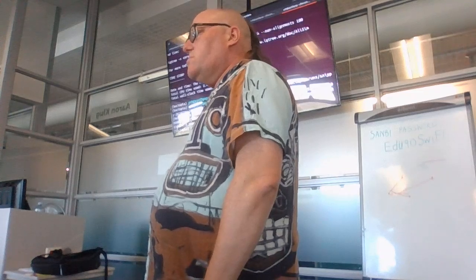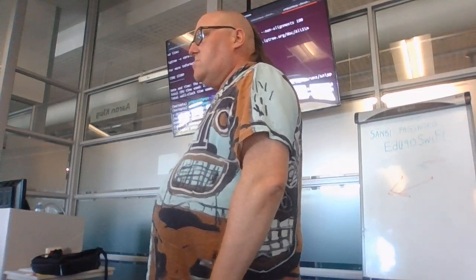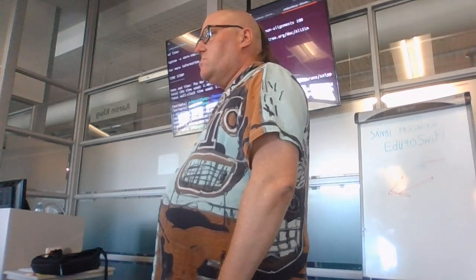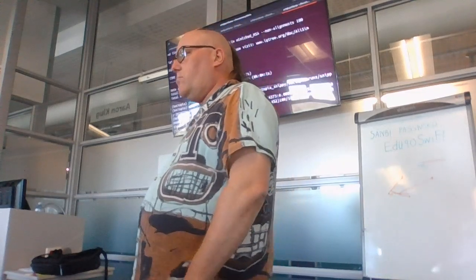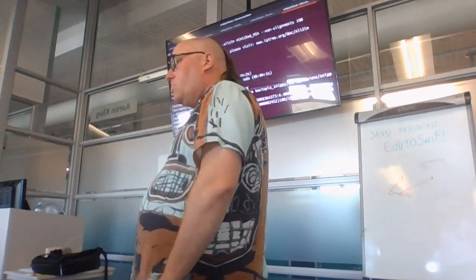On Terra, for the Bactopia pipeline, you actually do the assembly first and generate a MultiQC, and then a few steps down we check the MultiQC result, filter the samples, and put those into the next process.